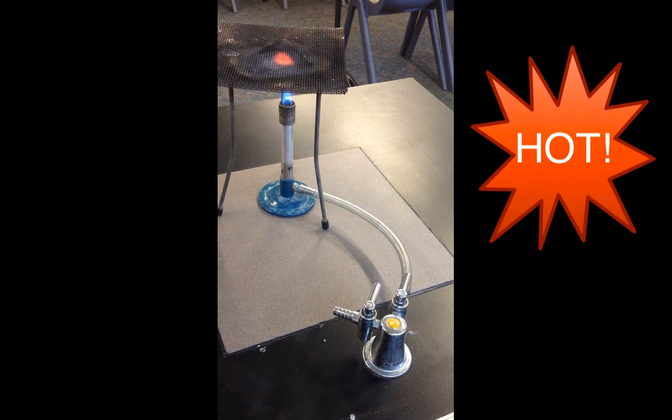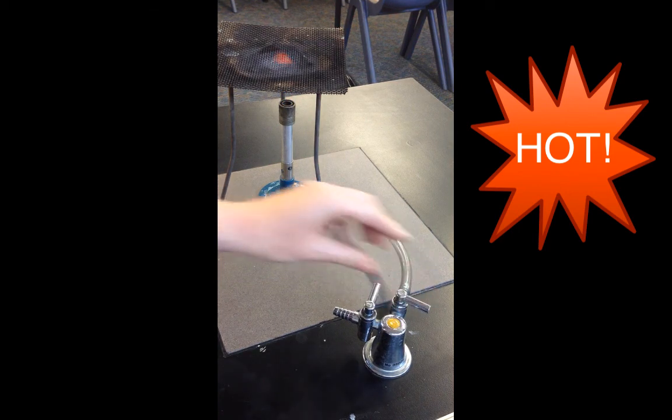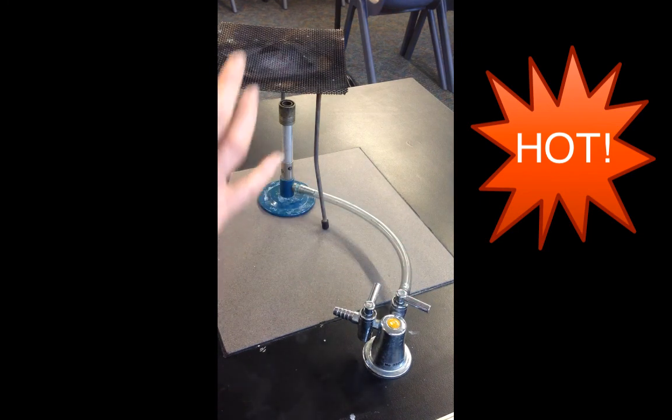When you're putting away the Bunsen burner, you would turn it off at the gas tap by making sure that the gas handle is now at right angles to the tube. And you would let all the equipment cool down before you put it away.